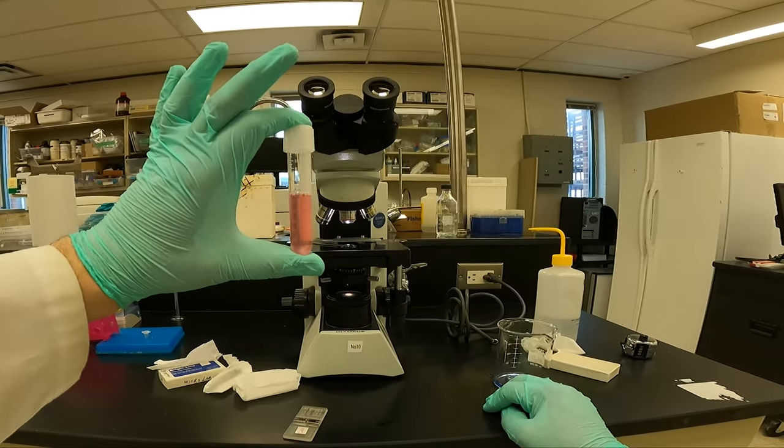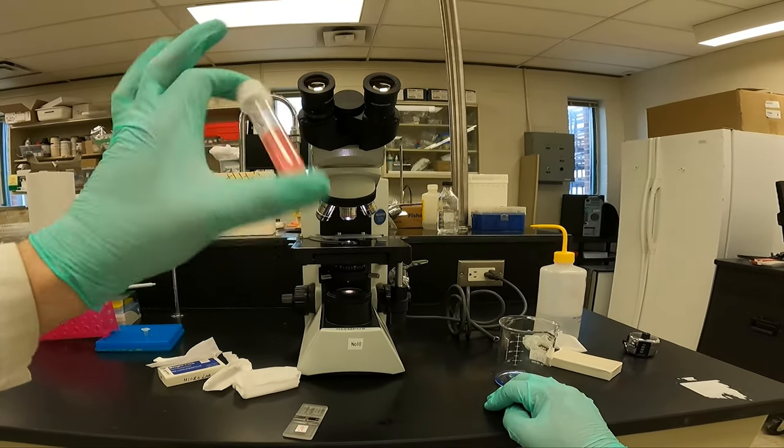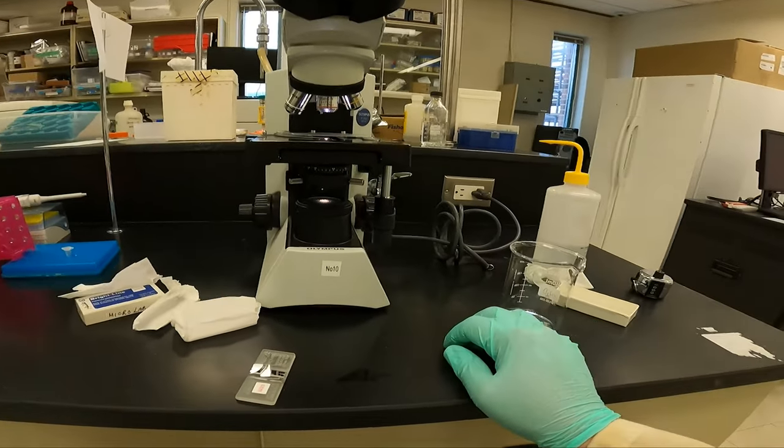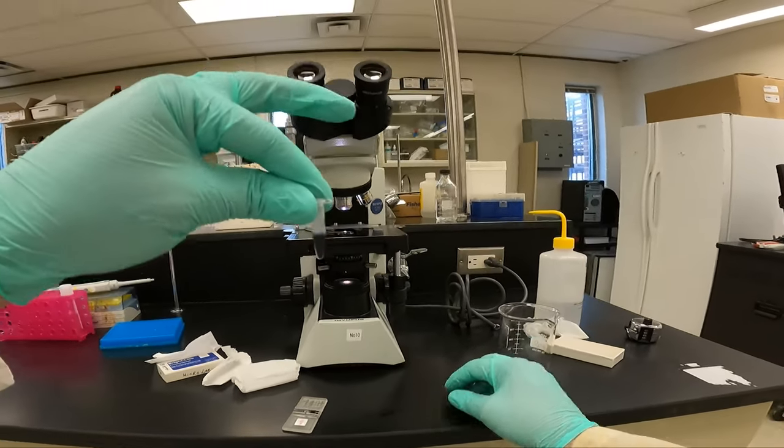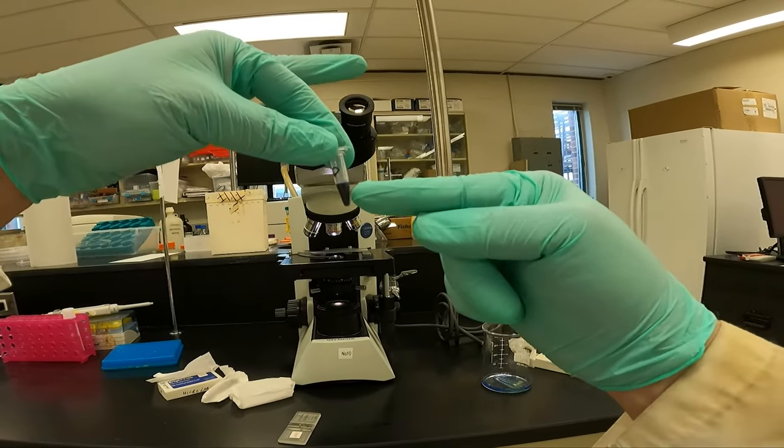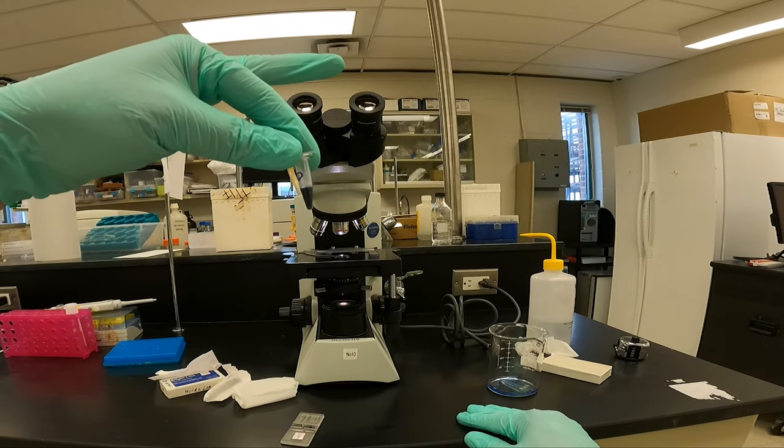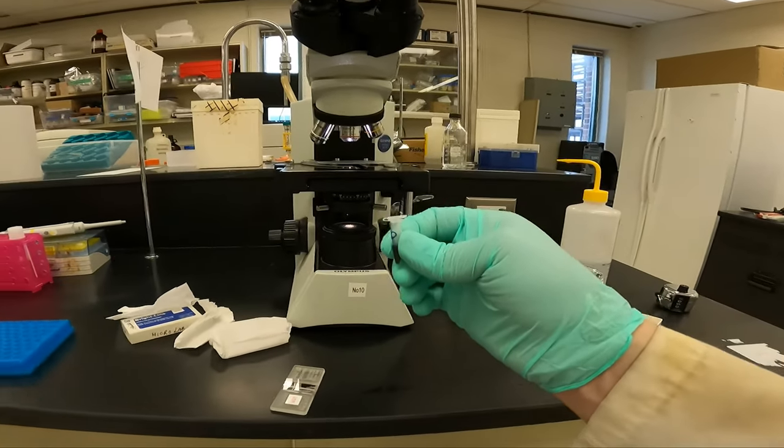Remember, they sink to the bottom, so make sure you invert it before you sample it. And you'll dilute this in trypan blue. I've done this already. I've taken 100 microliters of cells and 100 microliters trypan blue. A one-to-one dilution.